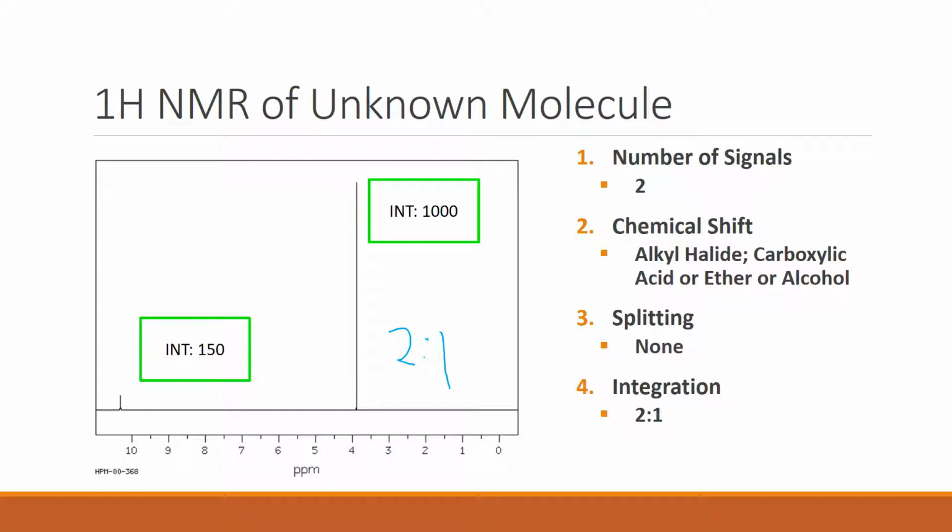And by the way, I should quickly mention the different environment aspect of this based on HNMR. So if we go back to our example that I pointed out, where you have a C to a C to an O to an O, and you have the H here, it's pretty clear that both, if you kind of think about the environment that these H's live in, it's exactly the same.